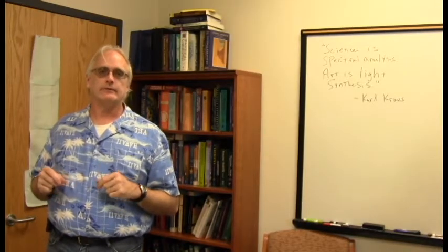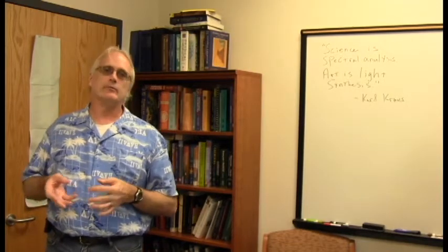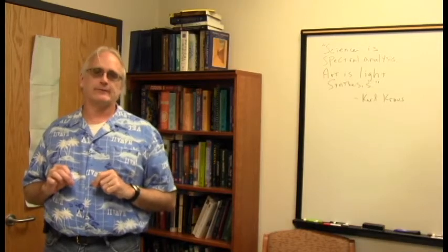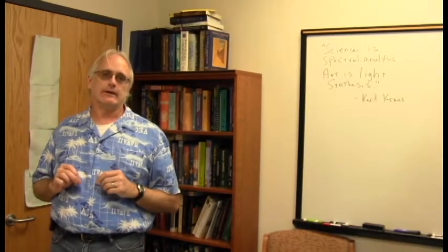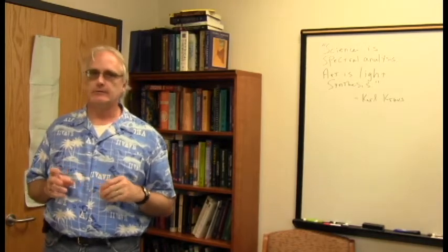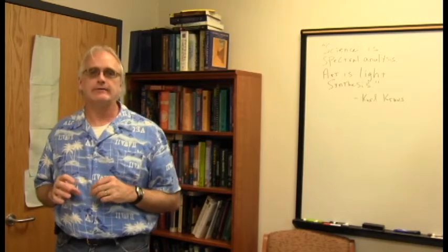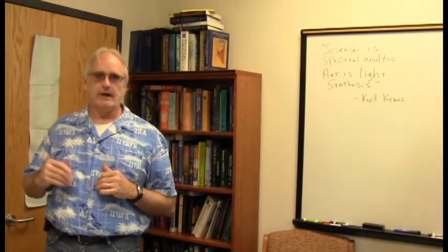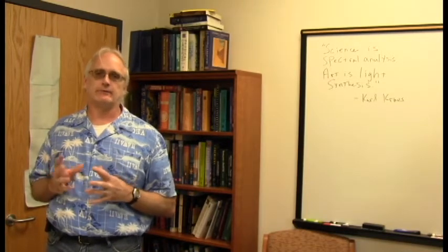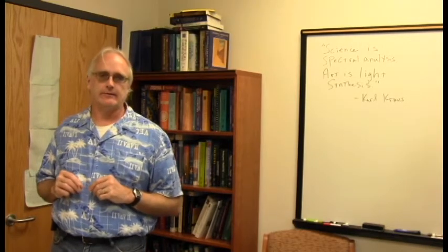Continuing on our effort to introduce coupling and coupling patterns and then immediately start talking about decoupling, what we've talked about so far is heteronuclear decoupling, essentially acquiring your carbon spectra as if the hydrogens aren't attached, by making them oscillate between their spin states so much that the carbon signals simply collapse to the average of all the spin states of the protons.